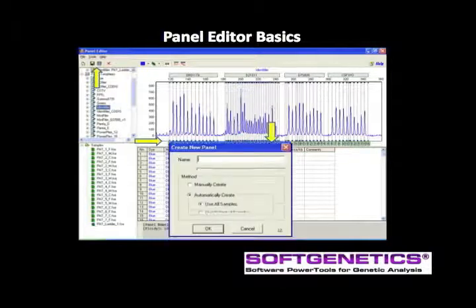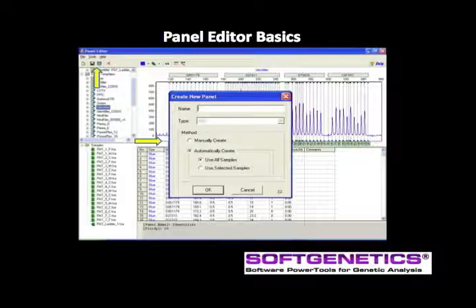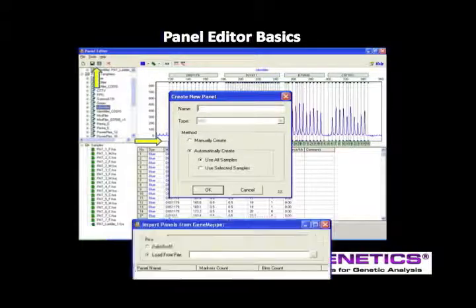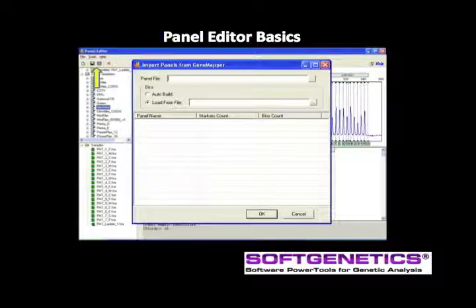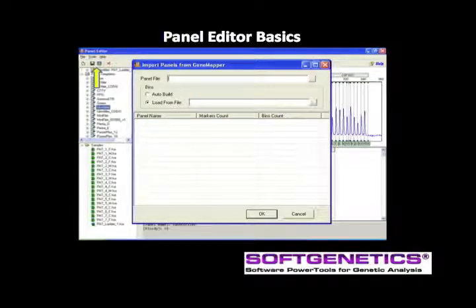Major human identification panels are preloaded in GeneMarkerHID. Custom panels may be easily made using File Create New Panel to create automatically using all samples, or manually using the mouse and panel table. Or, import ABI panels and bin files using File Import ABI Panels. Navigate to the saved panel and bin files and then select OK to automatically import the panel information from the genetic analyzer.